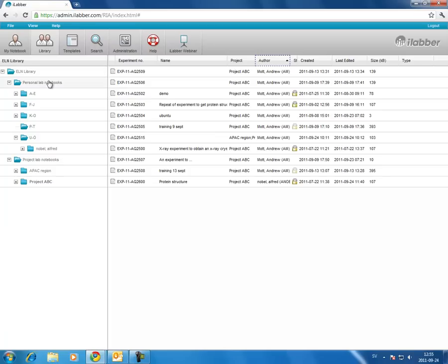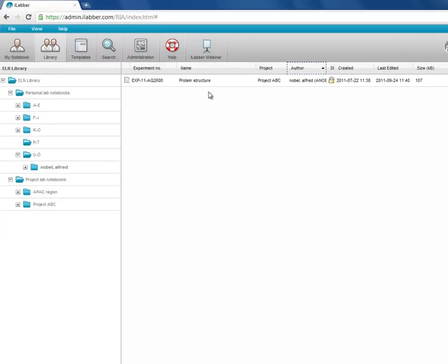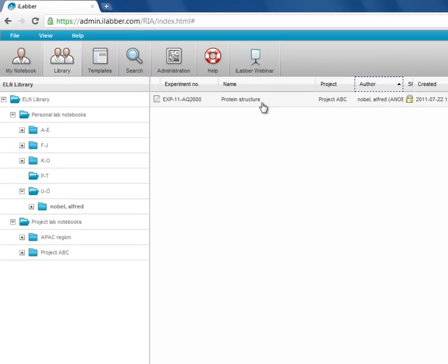You also can find your colleagues' experiments. They're sorted into different folders by name, and you can find a person and find their experiments.